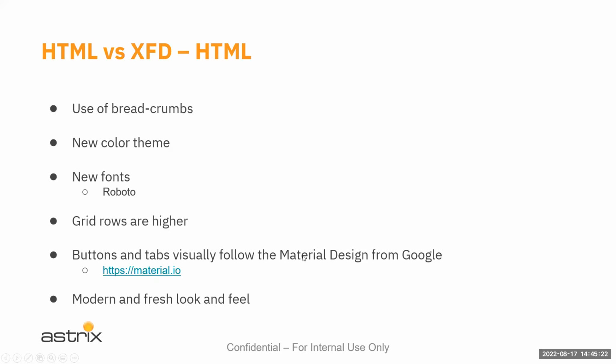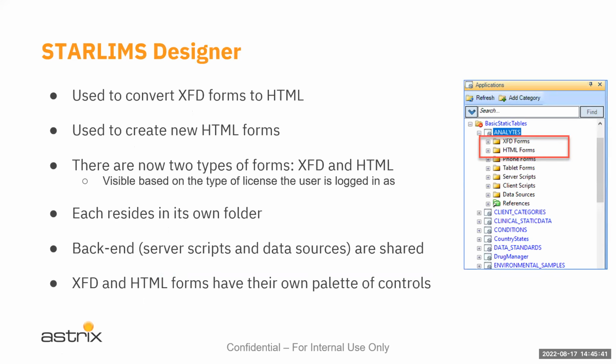They wanted it to look more like a website or more like an app that we're used to on our phones, right? So the buttons are real big, and when you click on it, there's an event and there's a visual cue that you clicked on it. So again, it's been modernized is the word.